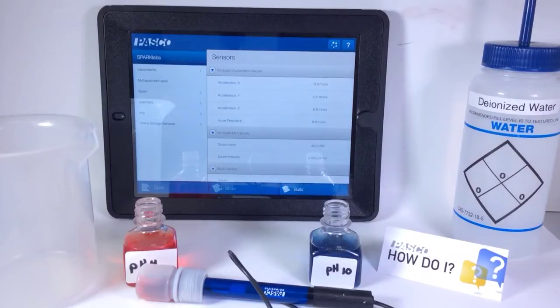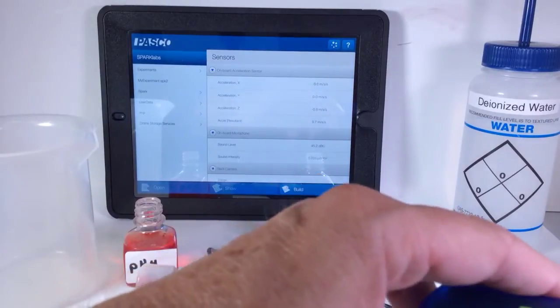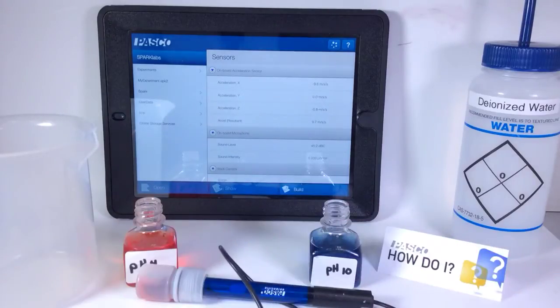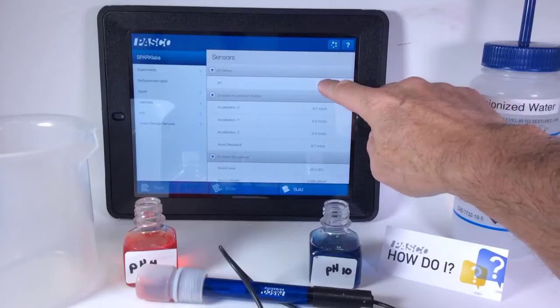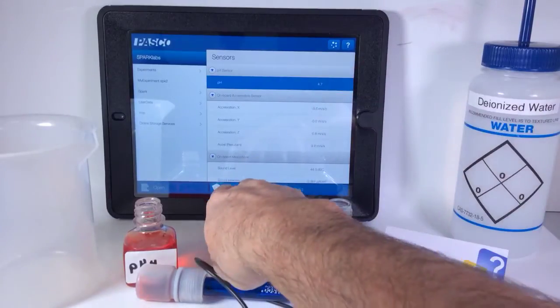How do I calibrate a pH sensor? First thing I'm going to do is plug the pH sensor into the interface. Then I notice that pH shows up. I'm going to tap that and hit the show path.